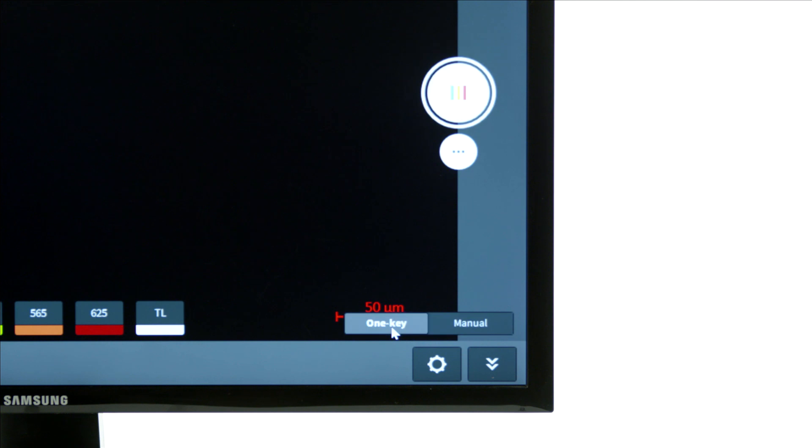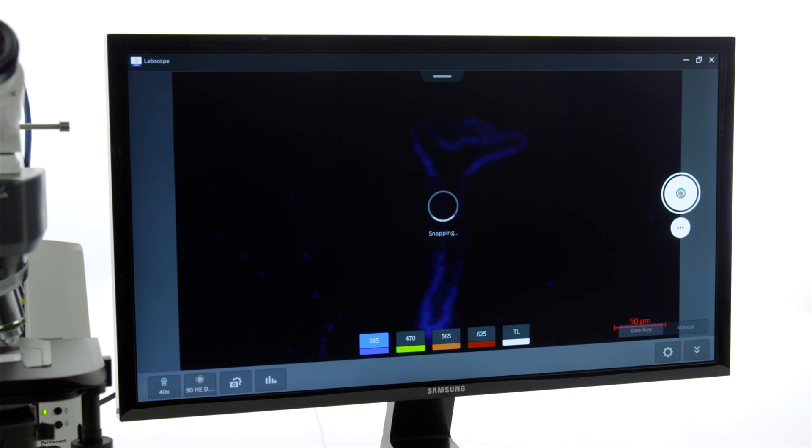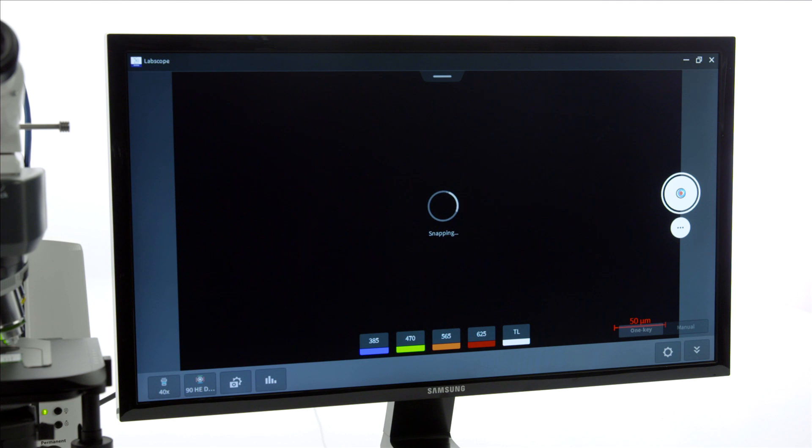With the one key mode, the system will automatically acquire the previously defined channels with the channel specific settings.